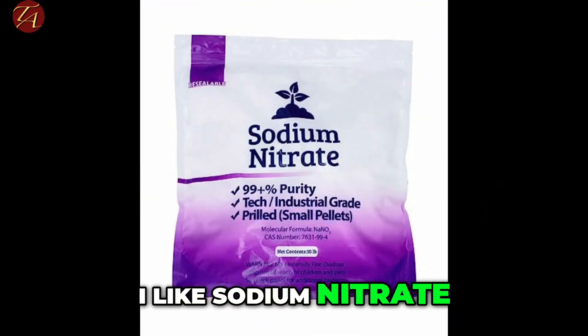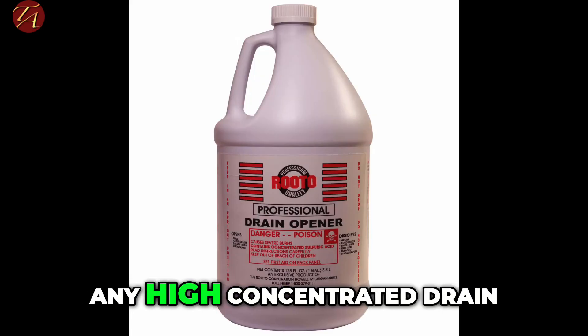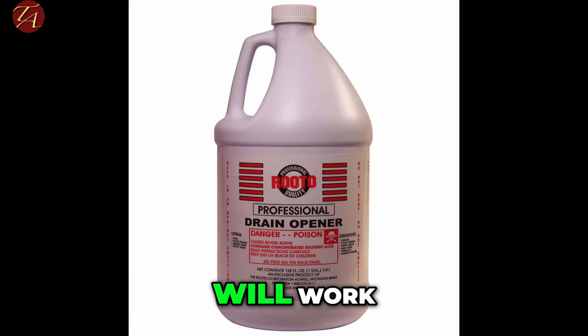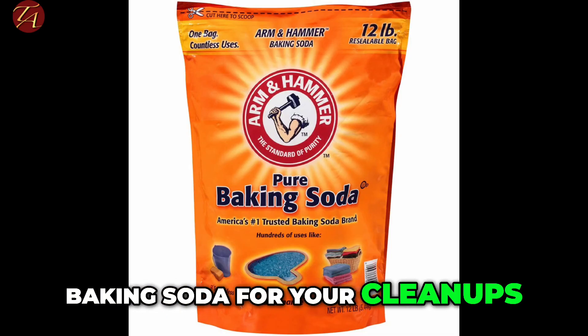I like sodium nitrate or potassium nitrate. Any high-concentration drain opener that contains sulfuric acid will work. And you'll need some baking soda for your cleanups.